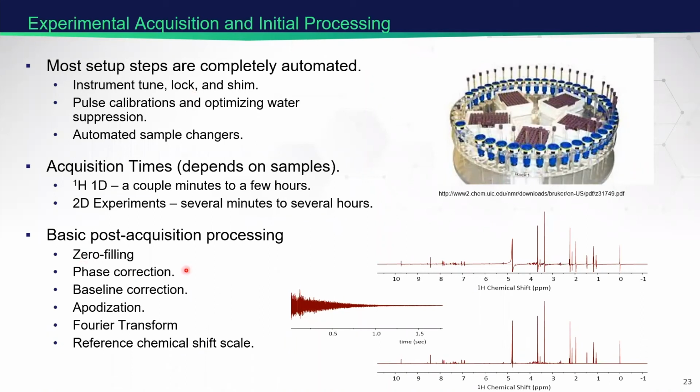Acquisition times. It really depends on your sample. If you have decent concentrations, it can only take a few minutes. But as you saw in that pore water sample that I showed earlier, the one before lyophilization, we might measure one of those for a couple hours. 2D experiments, you can count on them always taking longer than the corresponding 1D. But in decent samples, even a 2D experiment, especially homonuclear ones, can be quite fast. But then again, these can also extend to several hours or the better part of a day. Like I said, it always depends.